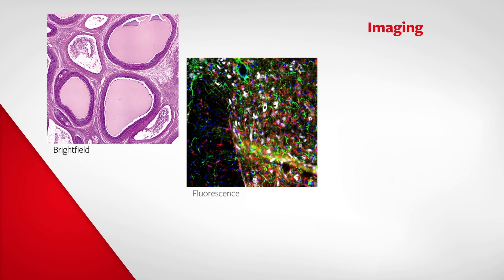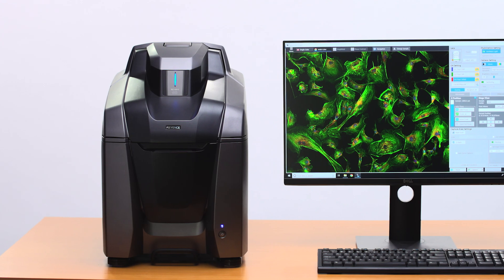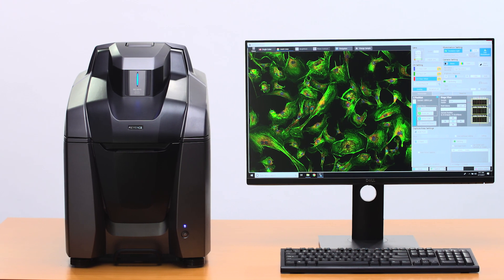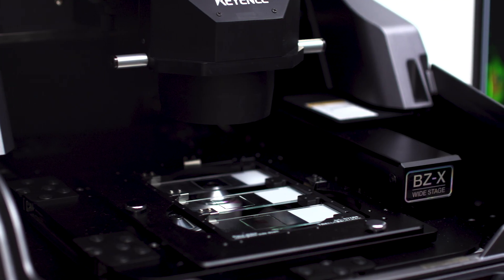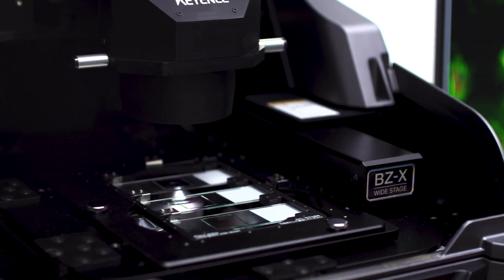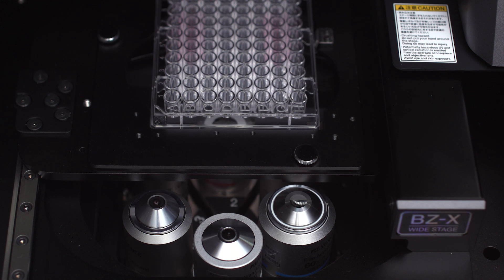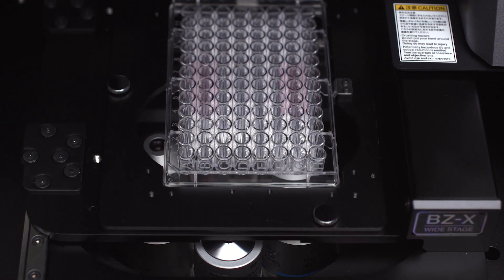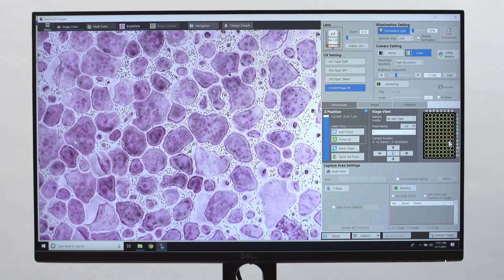Whether you require bright field, fluorescence, or phase contrast imaging, the BZ-X is the ideal solution to meet your research needs. With over 25 years of innovation in digital microscopy, Keyence has integrated its automation technology into a versatile, high-throughput imaging system.